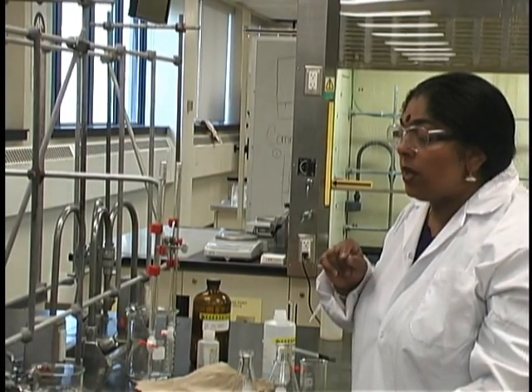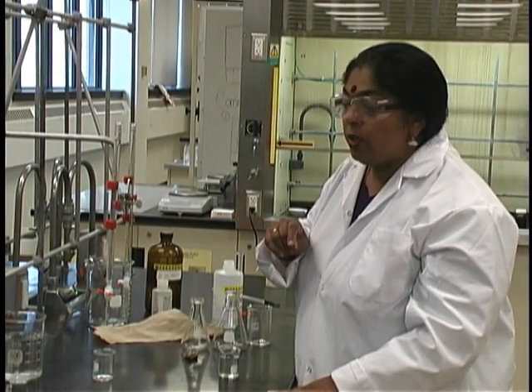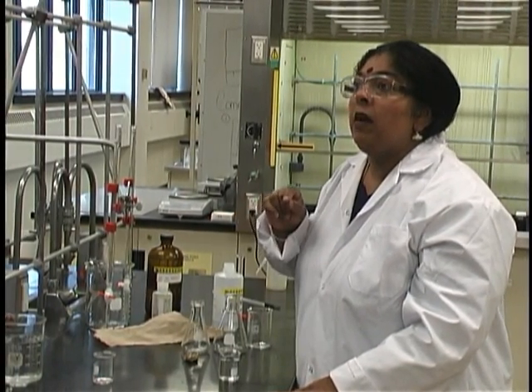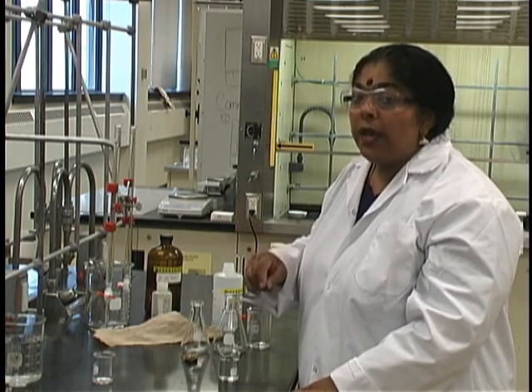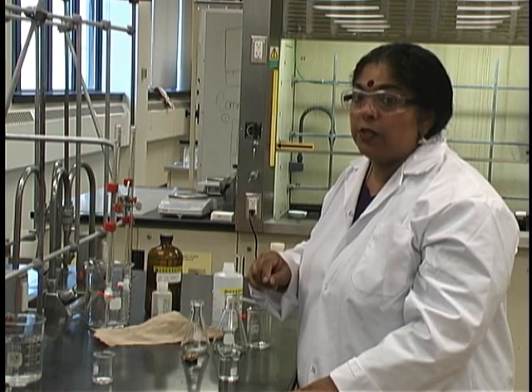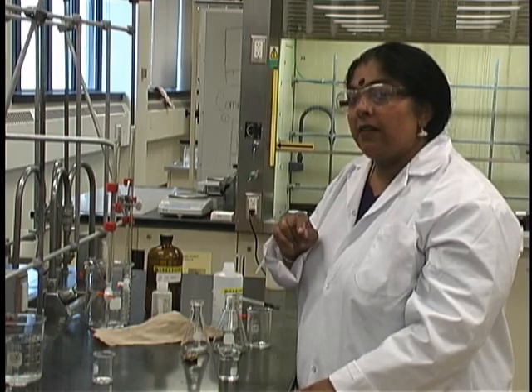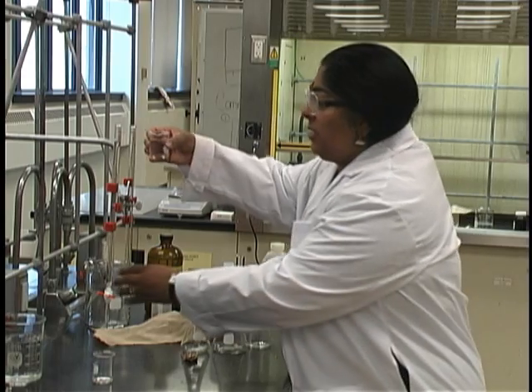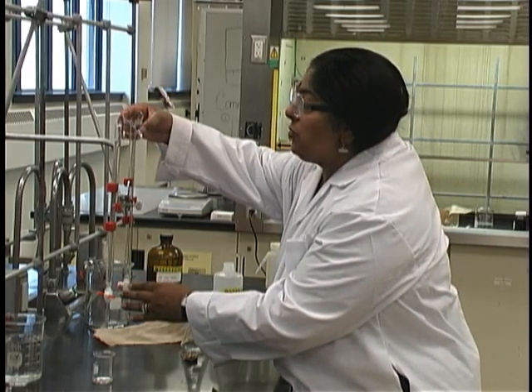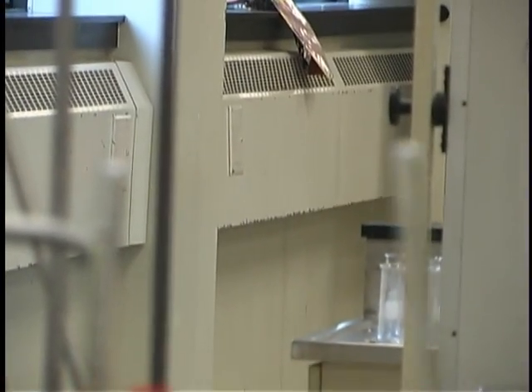You may also calculate the approximate concentration of your base solution by using the total volume, the initial concentration of the base, and its initial volume. You will not need this for any future calculations, but when you determine the exact concentration of your base, it's good to have a little check.